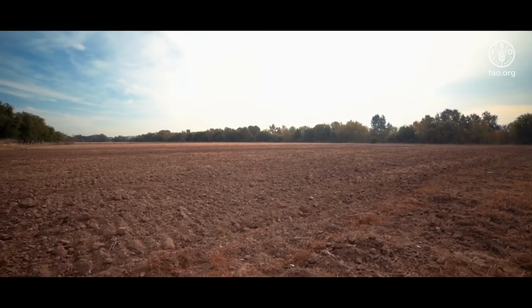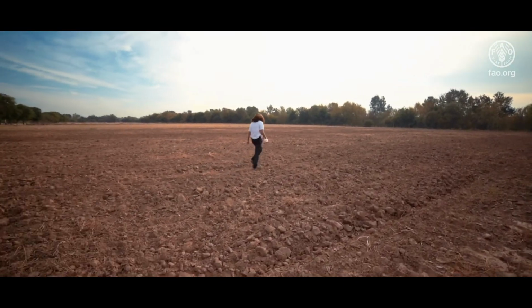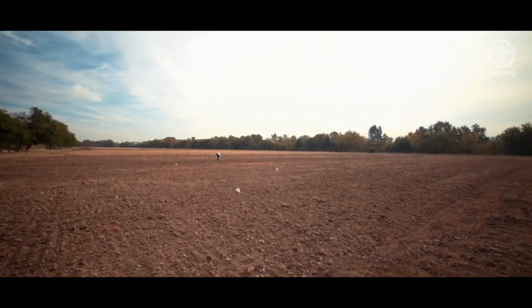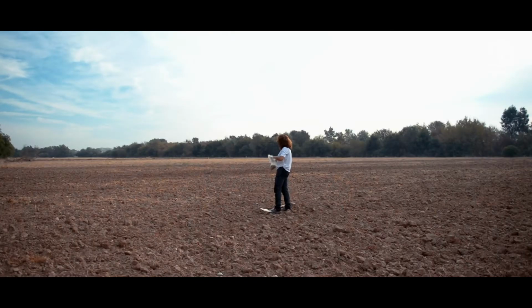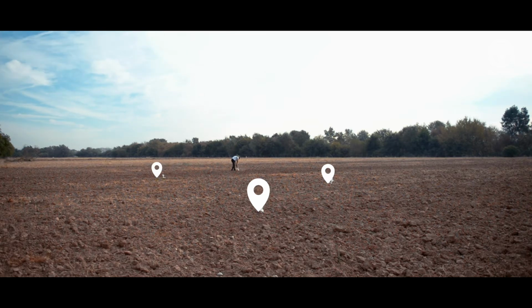The main goal of soil sampling is to determine average soil water properties for the target field. This information will be obtained by samples taken from specific points following a particular design or criteria. We recommend using a random sampling design, generating one composite sample for the entire field. Samples will be collected from locations that are randomly distributed across the field.